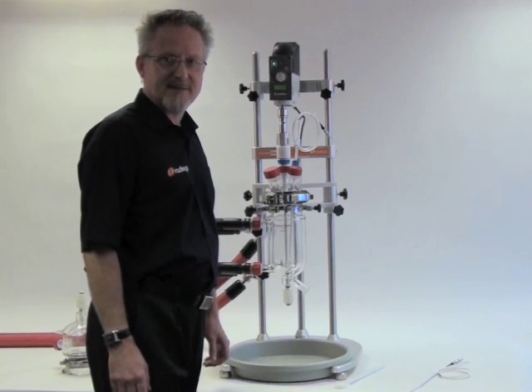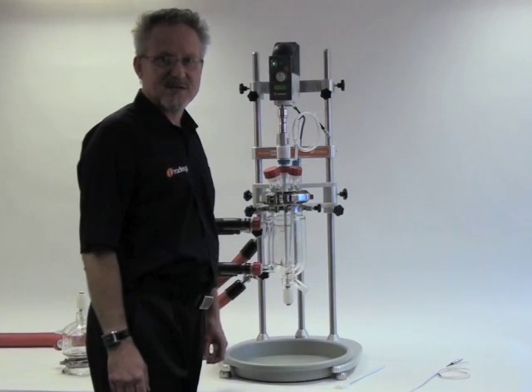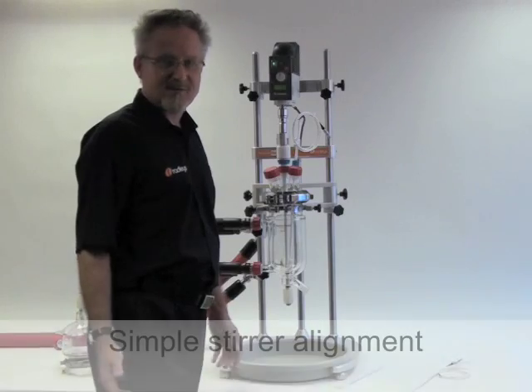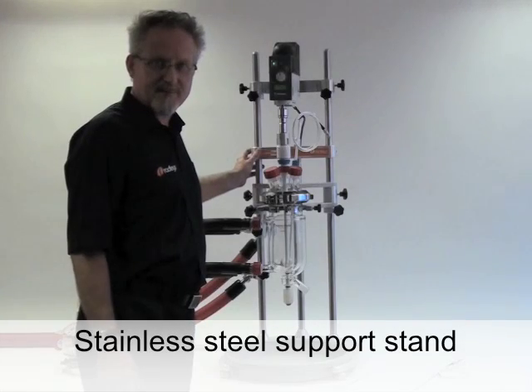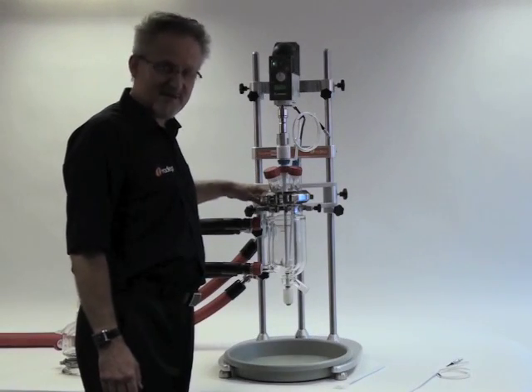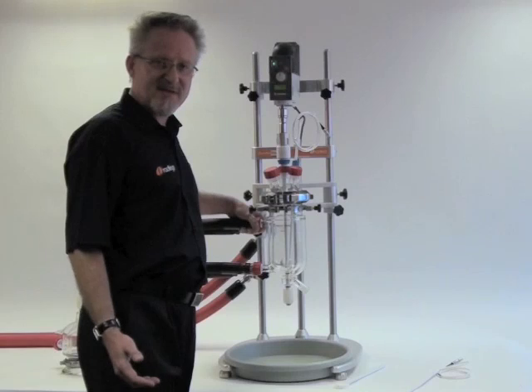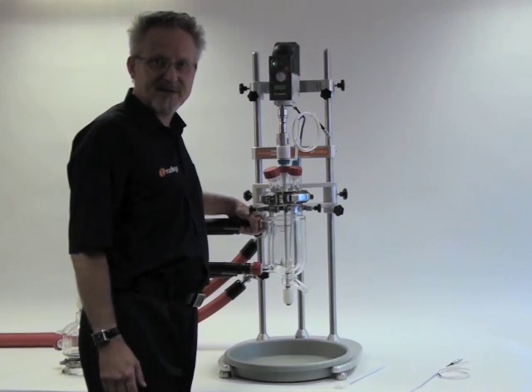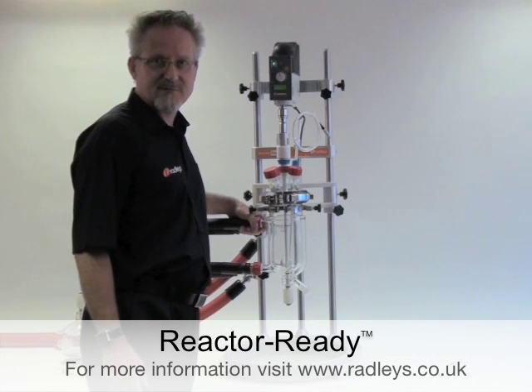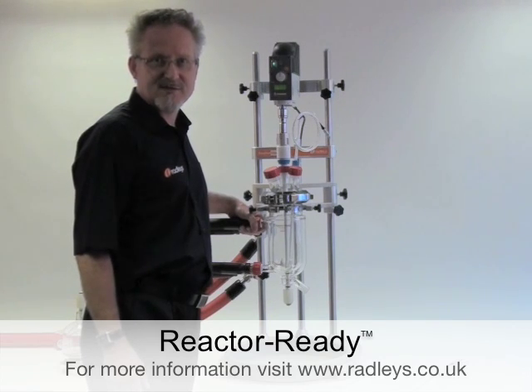To sum up: Reactor Ready is available with standard jacketed glass reactors from 250ml to 5 litres, both in single jacket and vacuum jacket options. It offers very easy stirrer alignment, a sturdy support frame with everything repositionable including the height of the vessel, and quick, easy and convenient vessel exchange and drain down. We at Radleys believe it's perfect for a chemist who requires a pre-configured, off-the-shelf, easy-to-use reactor station. For further information please visit www.radleys.co.uk or contact your Radleys distributor.